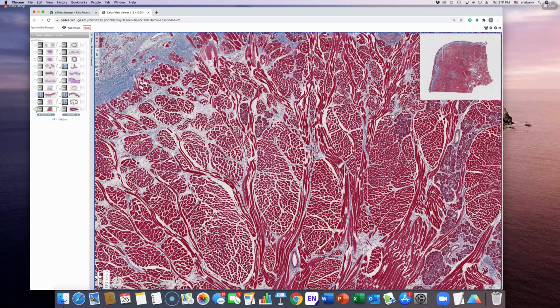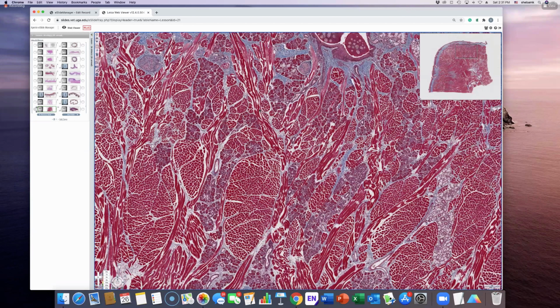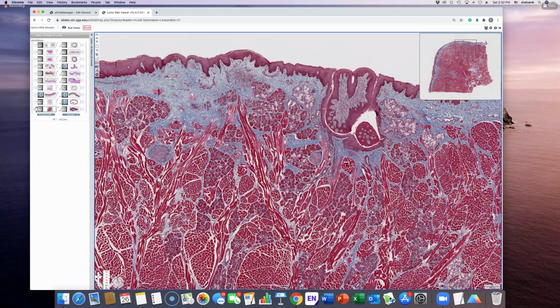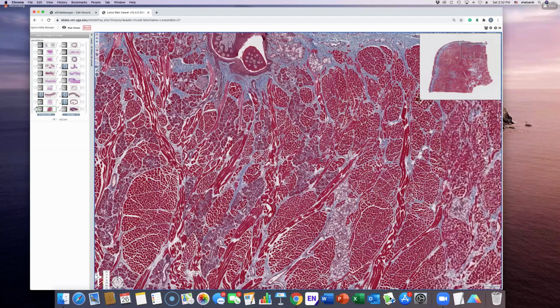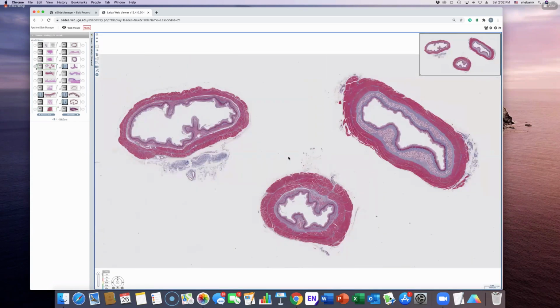More salivary glands. You didn't think that this tongue would have that many salivary glands, right? Here, this one is more mixed. It has mucus secreting and serous secreting salivary adenomeres. What do you call them? Yep, secretory units. So more mucus secreting ones down here. But all this is skeletal muscle for you. So we are done with the tongue. Then we'll go to the esophagus and we will wrap this up.